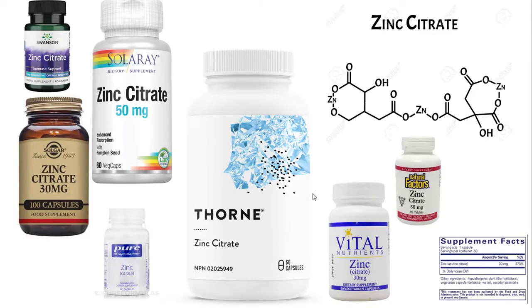All right. We could provide you a number of different zinc citrate bottles. These could come from different sources. We could get you to do one. We could get you to do all of them that we provide. We could get you to do a couple. It just really depends on how we're feeling at the moment, okay? So whatever we give you, again, make sure that you write down the brand name in your lab notebook. That's going to be pretty important.